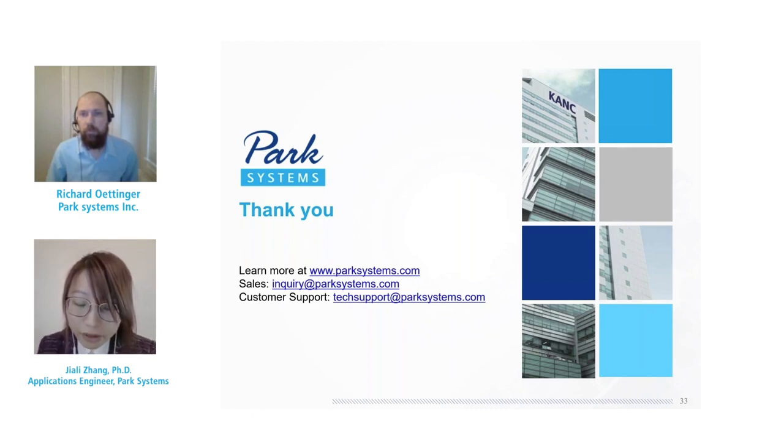So I'm still assuming that your cantilever is a rectangular cantilever beam. And for that kind of cantilever, yes, we can provide you mounting ways. There are 2 ways. First, you can use our provided clip-type chip carriers that should come with our NX10 systems when you purchase them. It uses pressure to mount your own unmounted cantilevers, and therefore you can assemble it to our probe hand, or you can use super glue to mount it to our chip carriers as well.